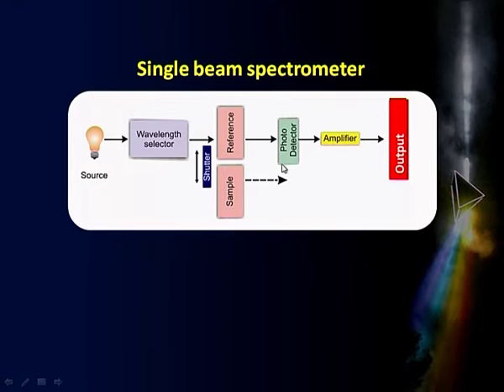So, the radiation of 200 nanometers will fall onto the sample and we see what happens. Then 201, 202, 203, 204, I can instruct my machine to do that. So, to make a spectrum, radiation from 200 to 350, whichever range I choose, will be made to pass through the reference material one by one, and whatever comes out will be picked up by the detector, suitably amplified, and put into some kind of storage device, because in the computer it will be in the memory.